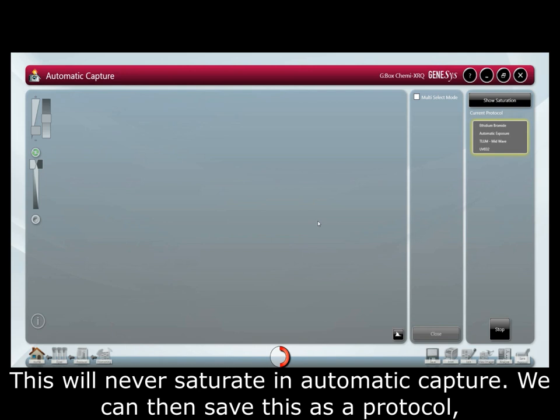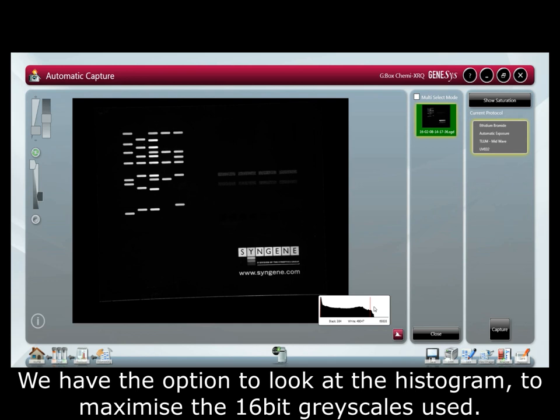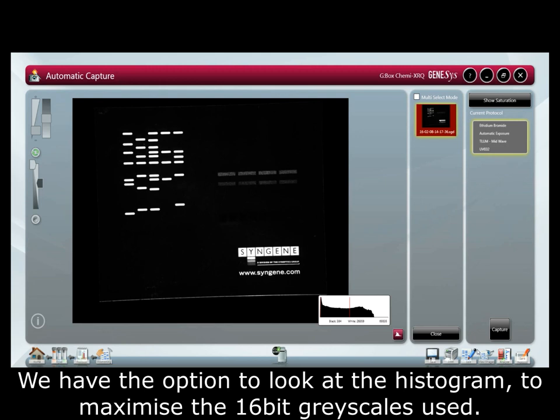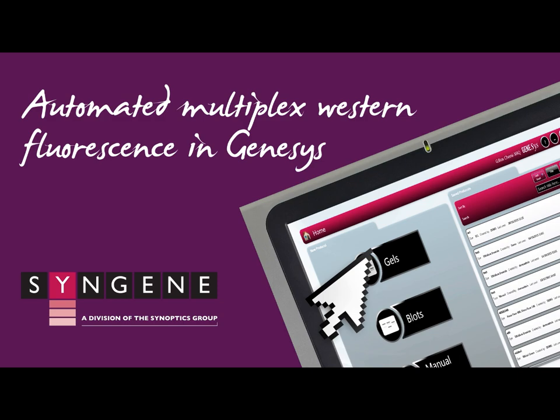This will never saturate in automatic capture. We can then save this as a protocol, meaning all future gels can be imaged in the same way, allowing us to skip the image setup and go straight to sample positioning. We have the option to look at our histogram to maximize the 16-bit grayscale used. As with all images in Genesys, these can be annotated or exported directly into Gene Tools for analysis and simple quantification.